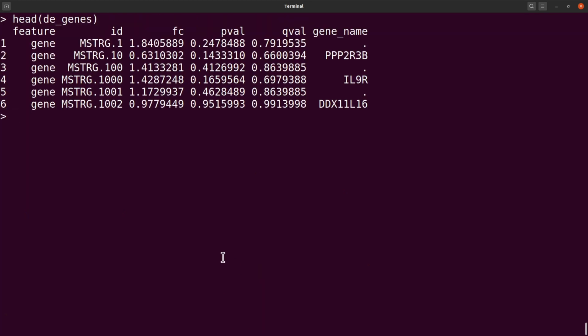And so we are going to rearrange the table. Okay, so we will rearrange so that the gene name comes somewhere here. We just want to get that here so that at least they are together. And so we will say DE genes again, and we say DE genes, and then we have c feature, the gene name.